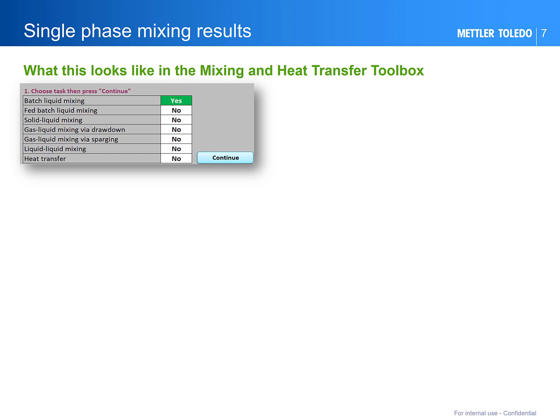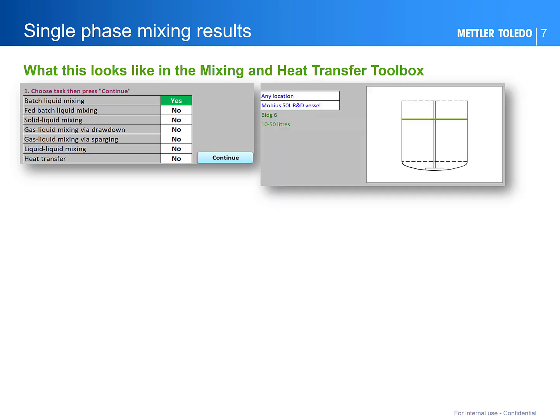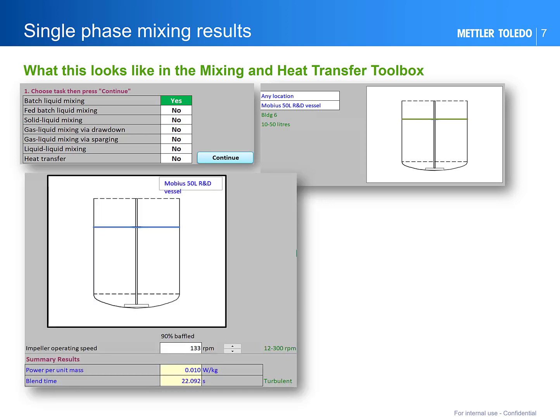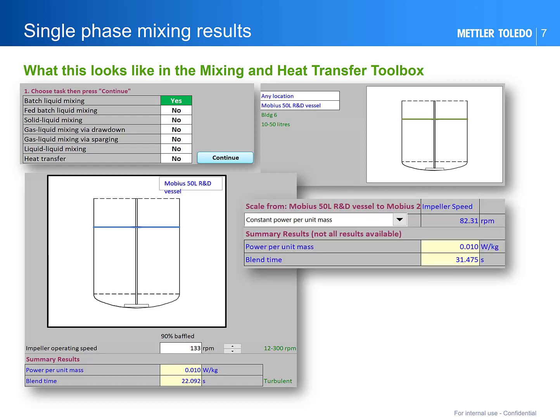These screenshots show how these assessments can be done in the DynaChem mixing and heat transfer toolbox. First you select your mixing task — here, batch liquid mixing — then select your vessel. You can also compare two vessels. You also enter the vessel contents and the impeller speed. This particular example is a bottom-mounted impeller. The power per unit mass and blend time are calculated, and you can also scale from one vessel to another — for instance, to find the impeller speed to maintain constant power per unit mass.